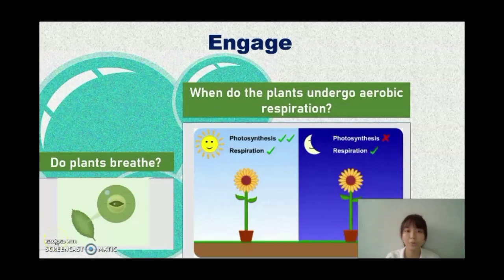Next, our group would like to introduce the experiment on aerobic respiration of peas that can be performed by students and teachers in school. Data loggers are used for the data collection in the experiment. In this experiment, the use of oxygen in the aerobic respiration of peas can be seen in a sealed container, in which the level of oxygen reduces with time.